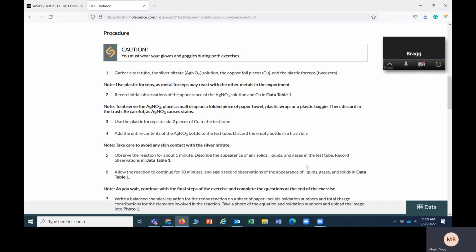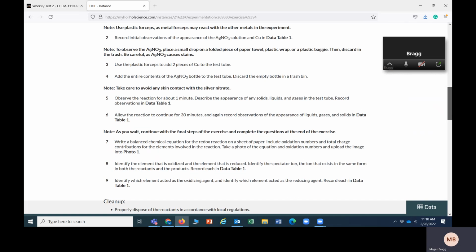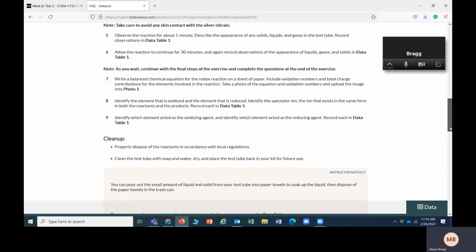That's all it is. Again, I wouldn't just do nothing while you wait. I'd go ahead and write out the reaction, get started on the next part, that kind of stuff.